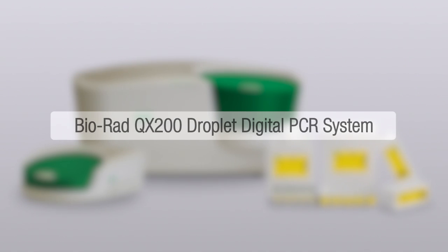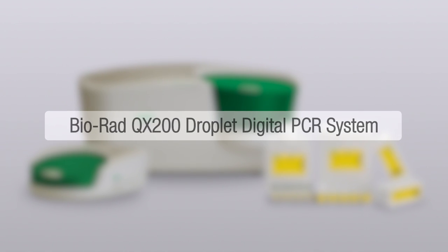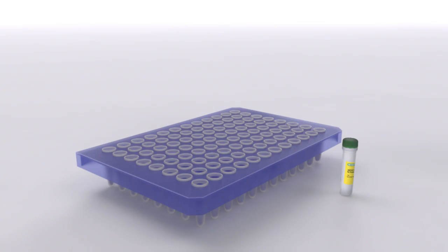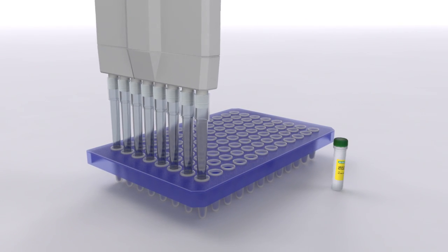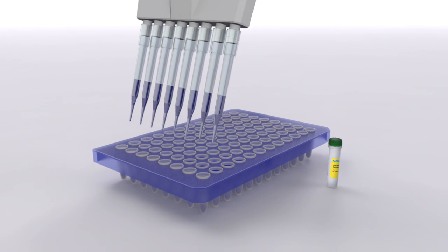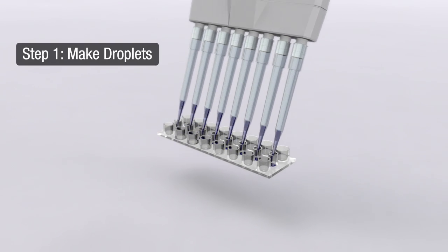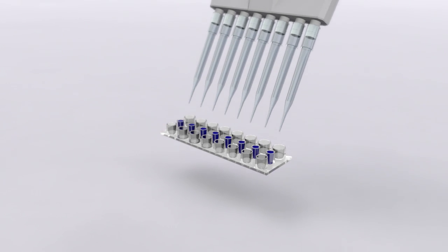Now, let's look at how the Biorad QX200 droplet digital PCR system performs digital PCR with unrivaled precision and sensitivity. The QX200 system uses a simple workflow that requires minimum hands-on time and procedures that are easy to perform. First, 20 microliters each of 8 prepared samples are transferred to the droplet generation cartridge.